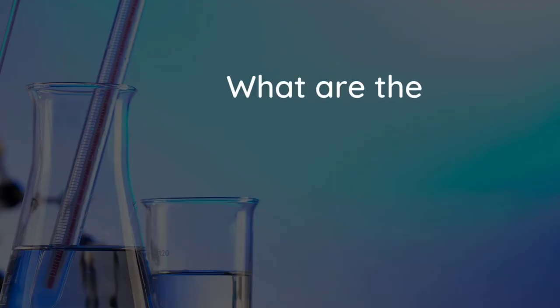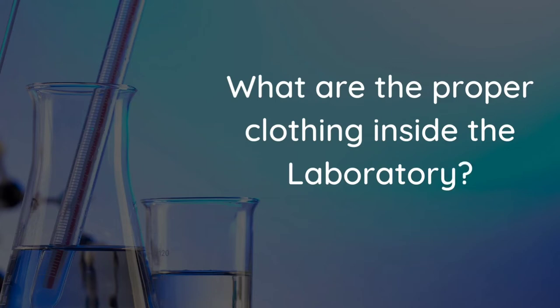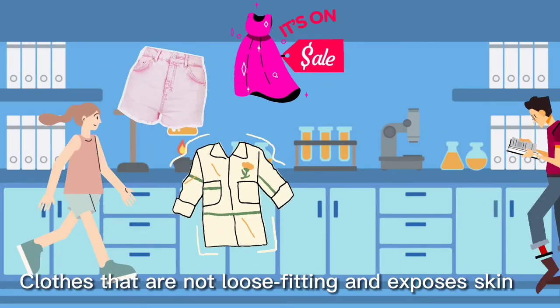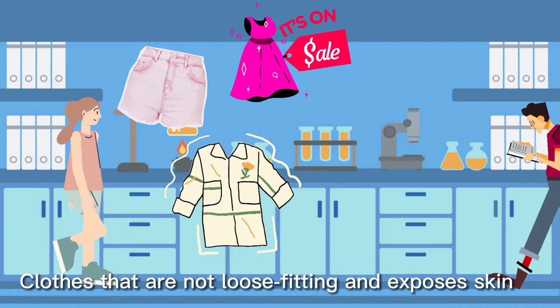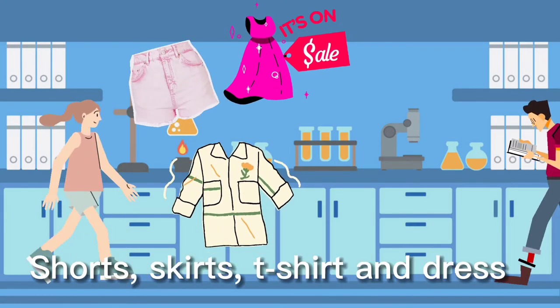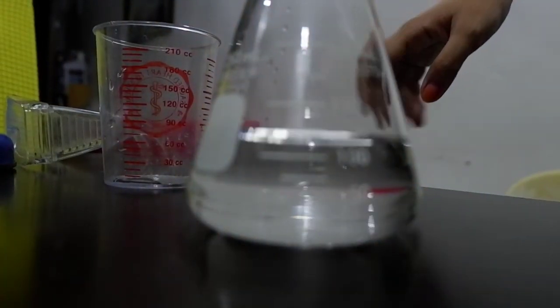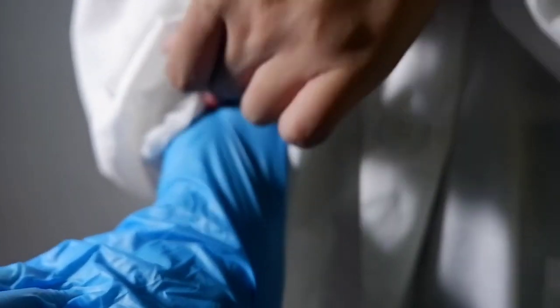What is proper clothing inside the laboratory? What not to wear: You must not wear loose-fitting clothes or clothes that expose your skin, such as shorts, skirts, t-shirts, and dresses, because there's a higher risk of contact with chemicals. Loose-fitting clothing like long sleeves may also risk knocking down equipment or coming in contact with solutions. You must wear clothes made from natural fibers with fitted clothing and long pants that cover your entire body.